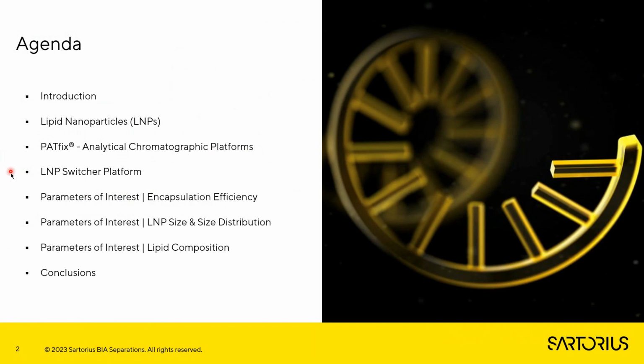And then I will turn to the main topic of today's lecture, the LNP Switcher Platform. We're going to go through three different parameters of interest regarding LNPs: encapsulation efficiency, LNP size and size distribution, and lipid composition. At the end, I will give a quick conclusion of today's webinar.